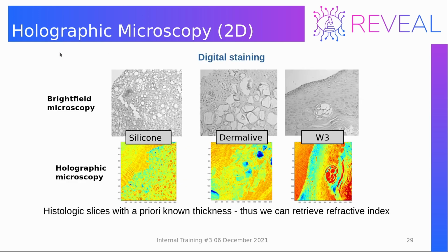So to conclude this holographic microscopy part, some time ago we were asked to identify dermal fillers in biological human tissue.